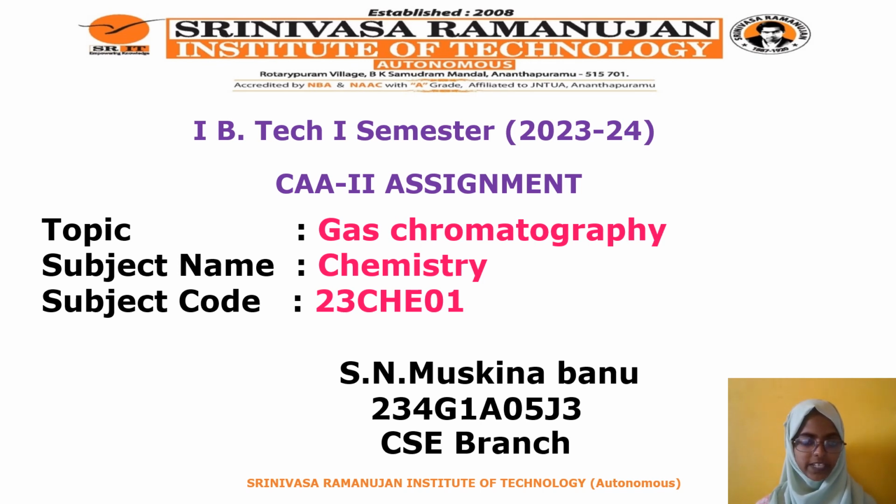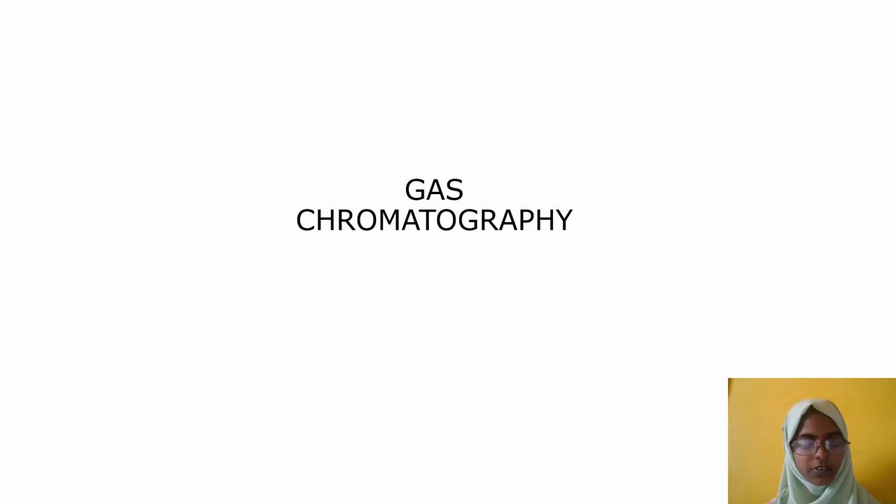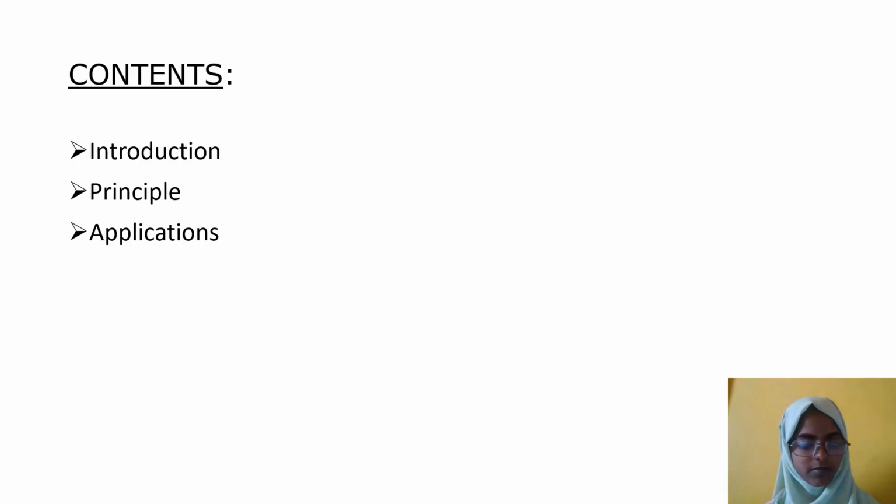Today my topic is gas chromatography. Today we are learning about gas chromatography and how it works. What are we discussing? The contents of gas chromatography are first the introduction, then some basic principles and applications of gas chromatography.